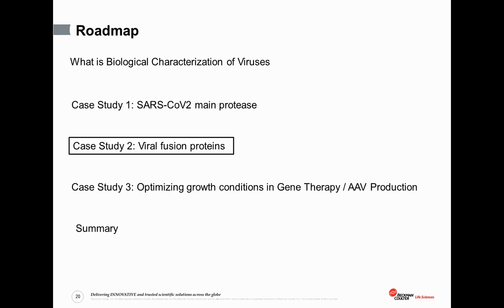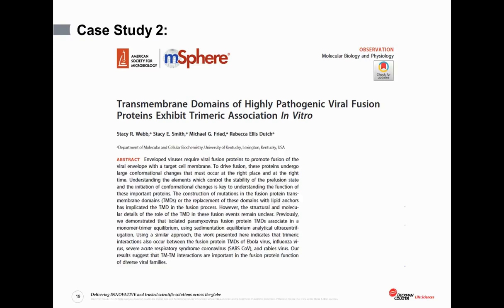And the second case study is all about viral fusion proteins, and it uses a slightly different experimental technique. So let's put the context of the second case study together. This is an experiment carried out using sedimentation equilibrium, and we'll talk about that in just a moment. But first, the biological context.